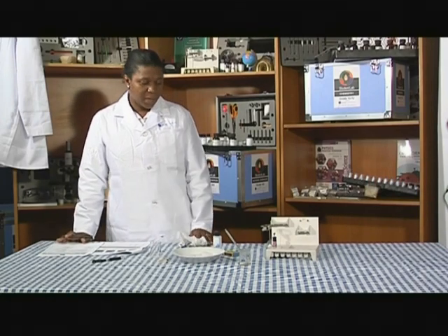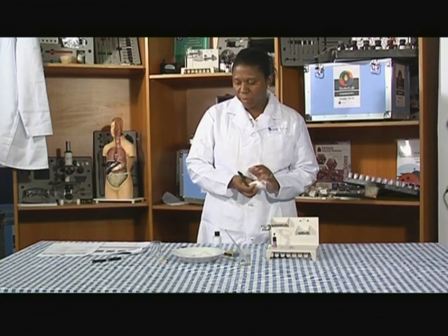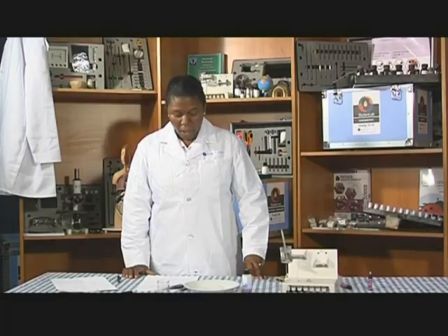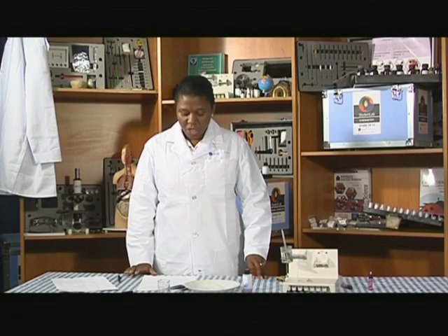Grade 10, chemistry experiment. The knowledge strand is matter and material. The topic is three states of matter. The experiment we are doing today is the heating and cooling curve of water. The aim of this experiment is to investigate the cooling and heating curve of water. Our hypothesis for this experiment is, will the increase or decrease in temperature change the state of water?